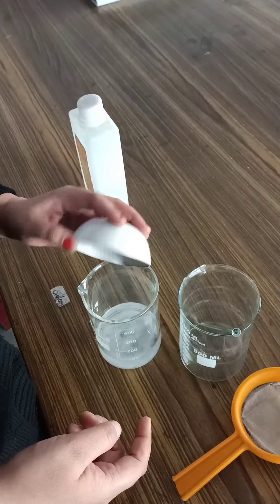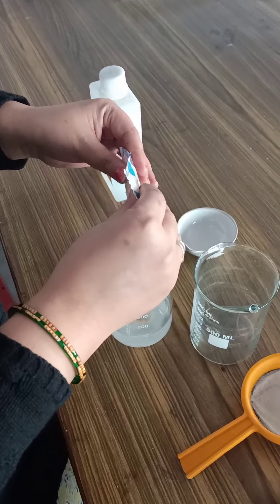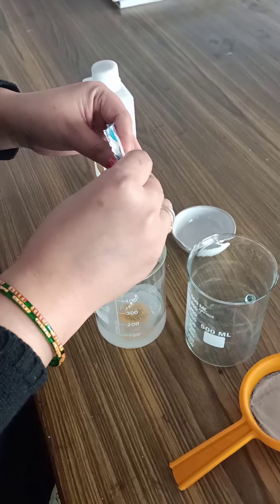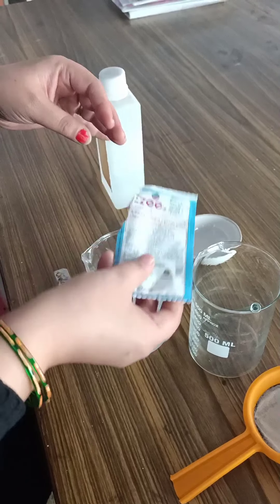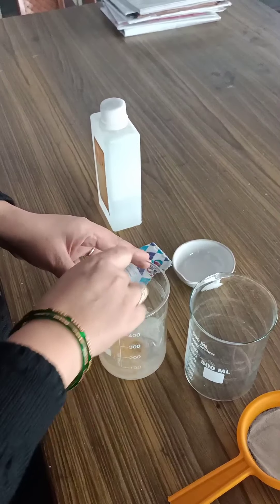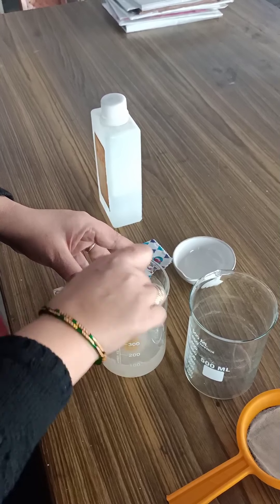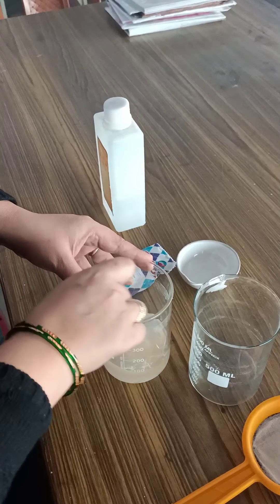The requirements for this experiment will be ethanol, distilled water — we have taken distilled water in this beaker — salt, an empty beaker, a strainer, a banana, liquid detergent, and a poly bag for squeezing or mashing the banana.